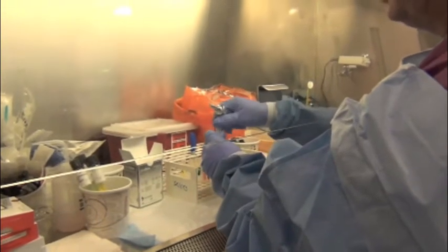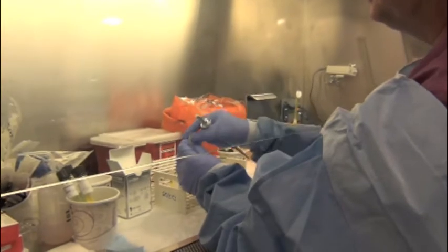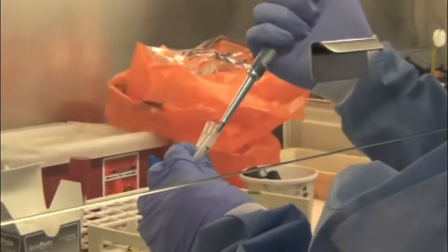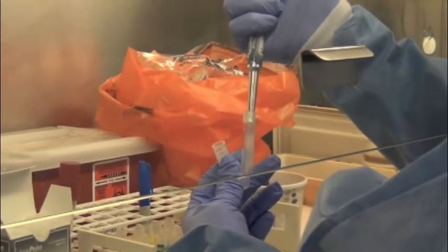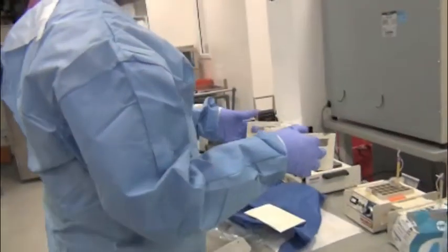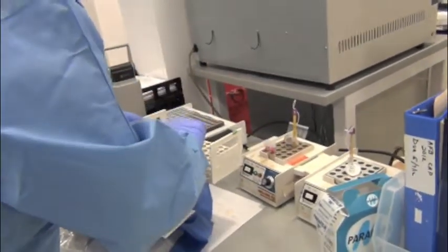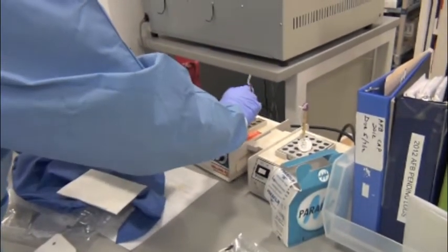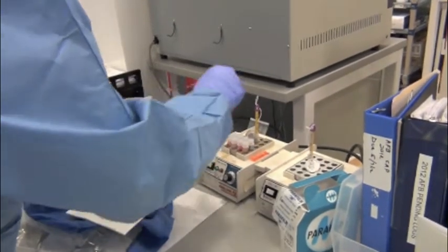Okay, now I'm going to take 100 microliters out of the lysis tubes and put it into the probe tube. The probe tubes now go at 60 degrees. For how long? This goes for 15 minutes.